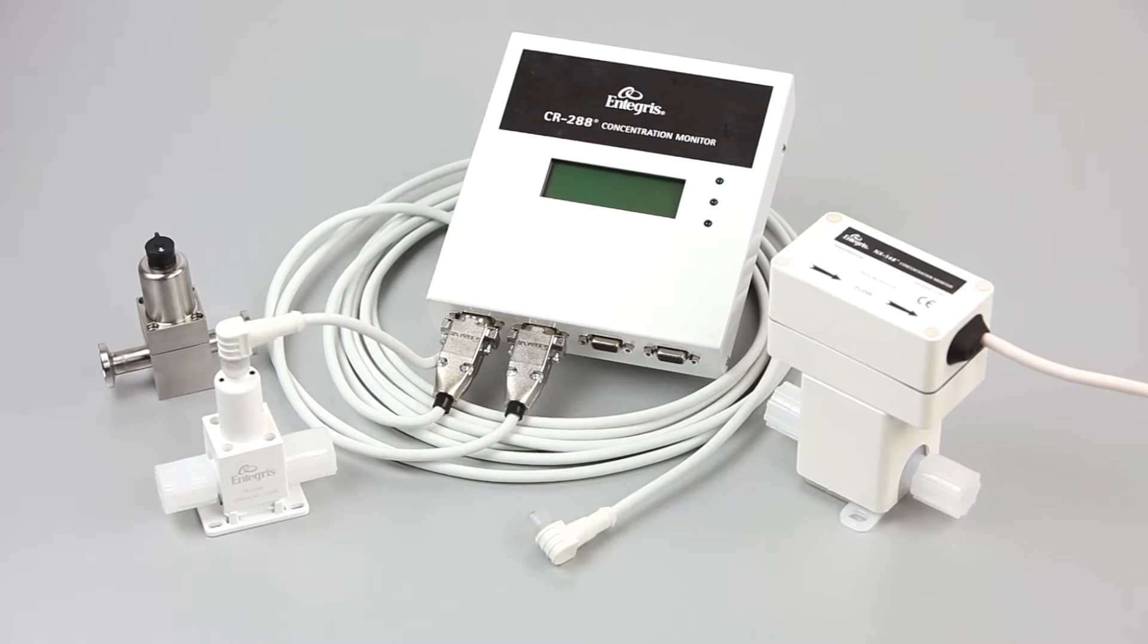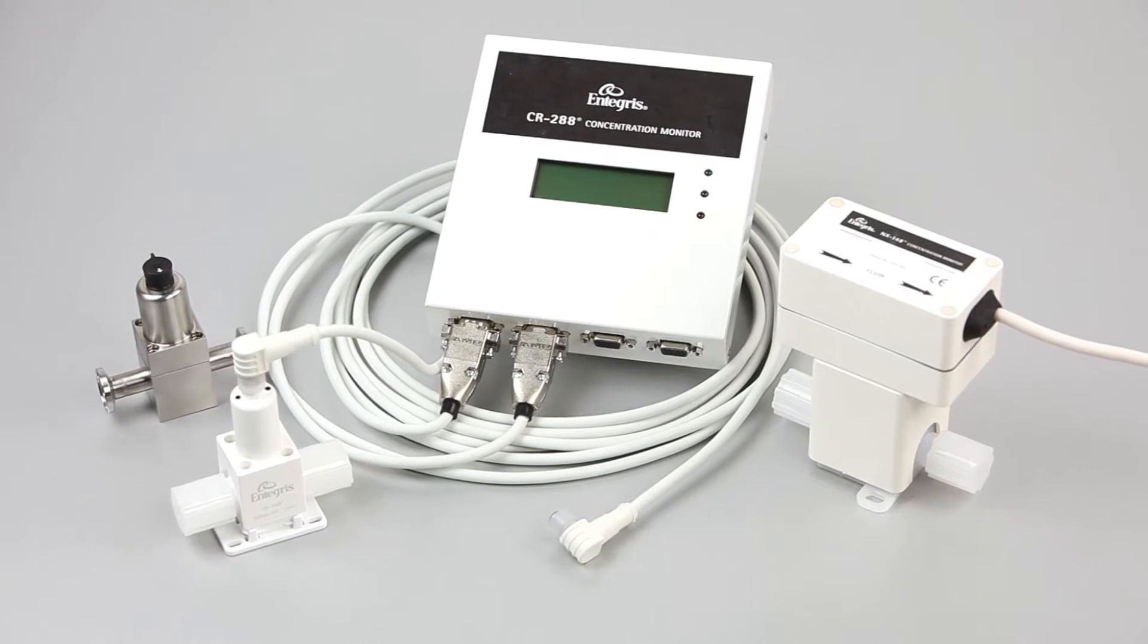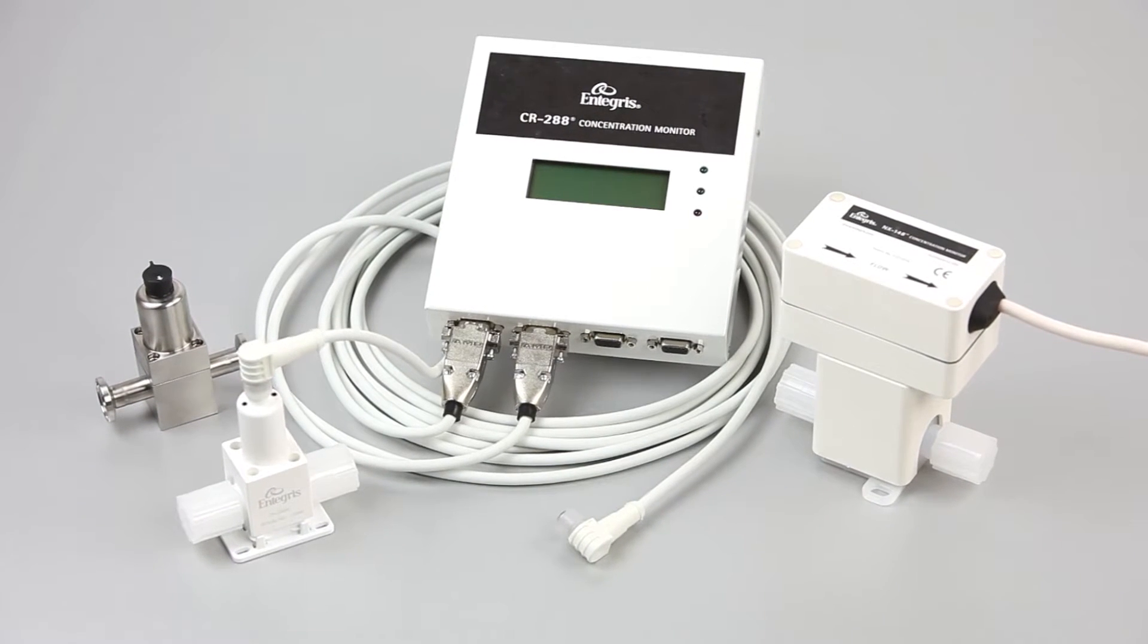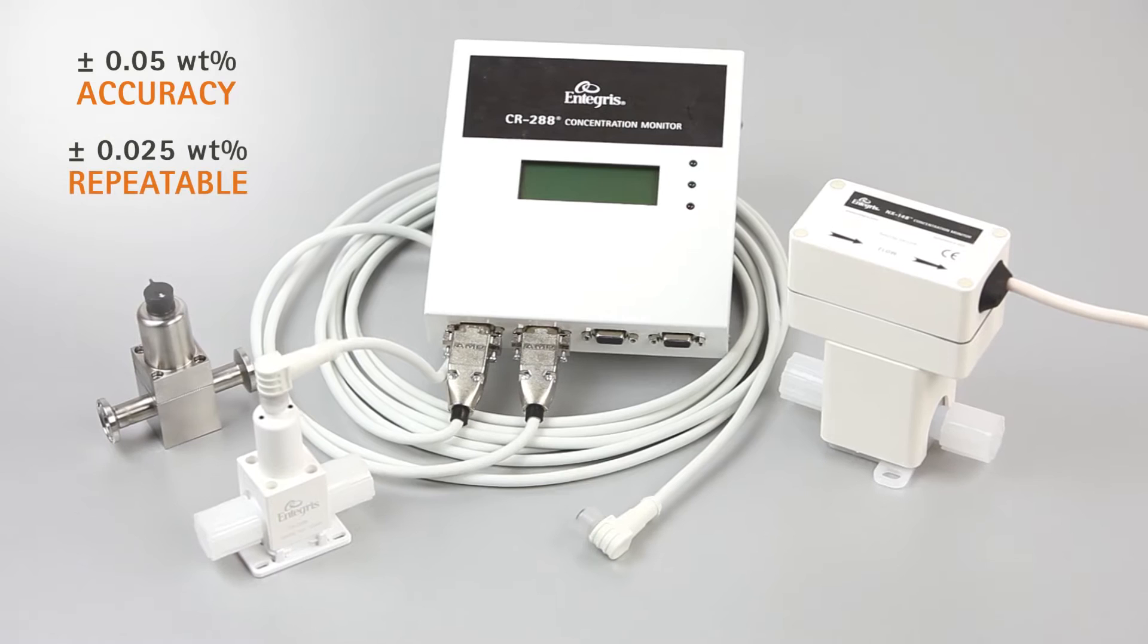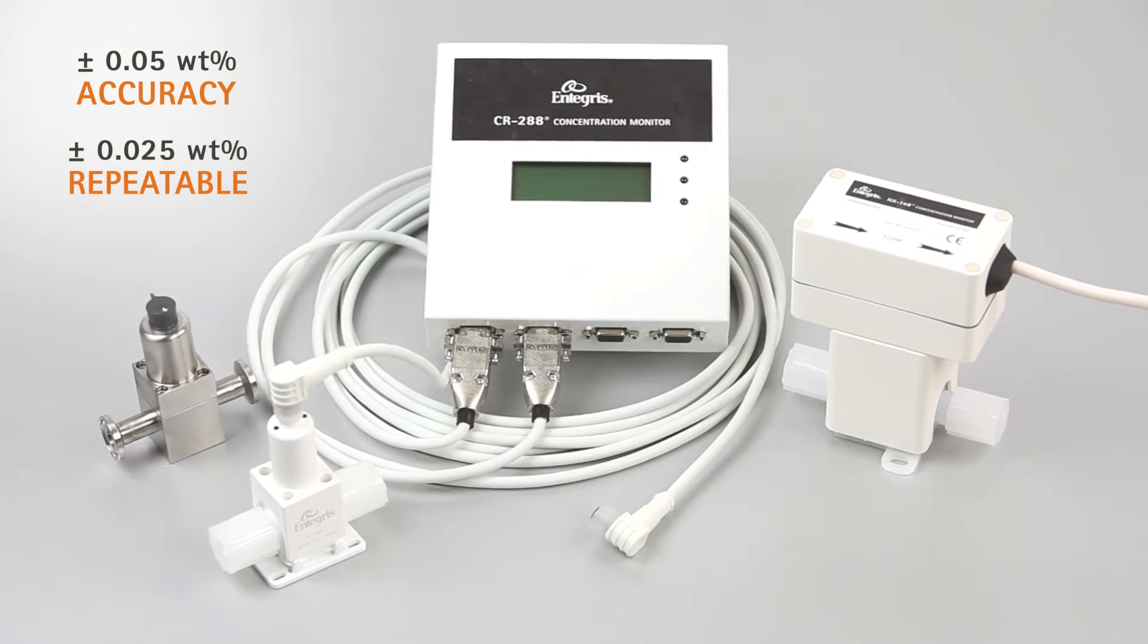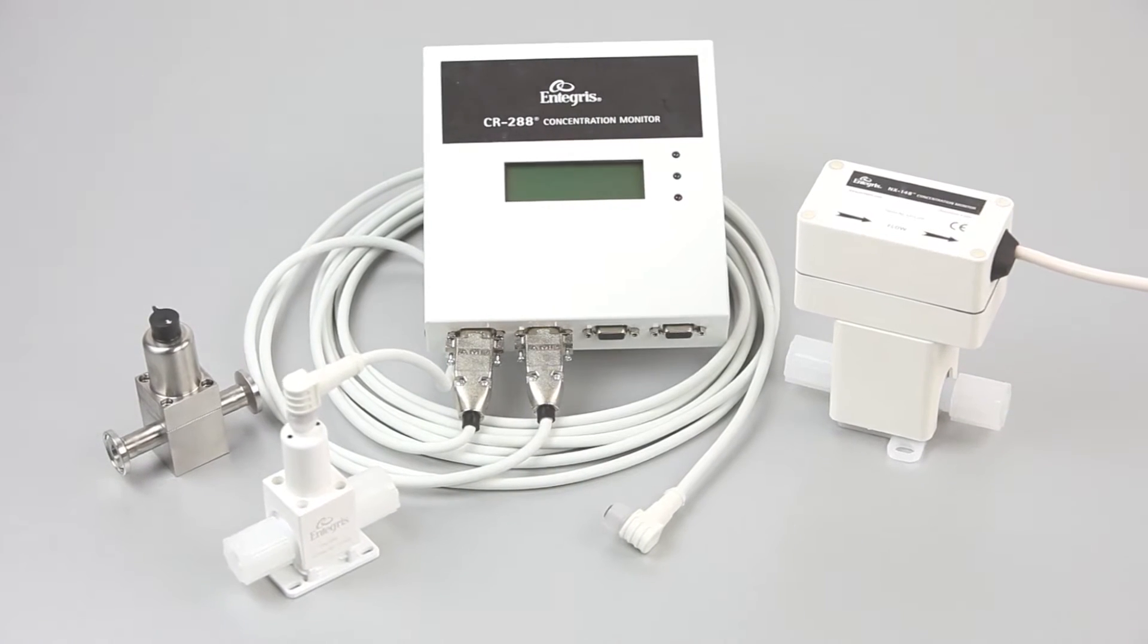Discover the Entegris Index of Refraction Concentration Monitors for accurate and repeatable product validation, product purity assurance, and quality control.